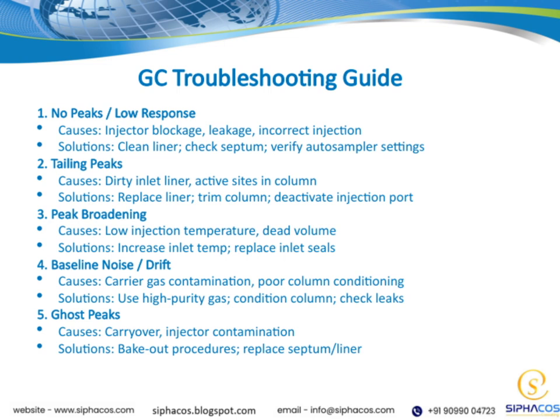This can often be caused by injector blockage, leaks, or incorrect injection techniques. To troubleshoot this, I recommend cleaning the liner, checking the septum for any damage, and verifying that your auto-sampler settings are correct. These steps help ensure the sample is properly injected and detected.